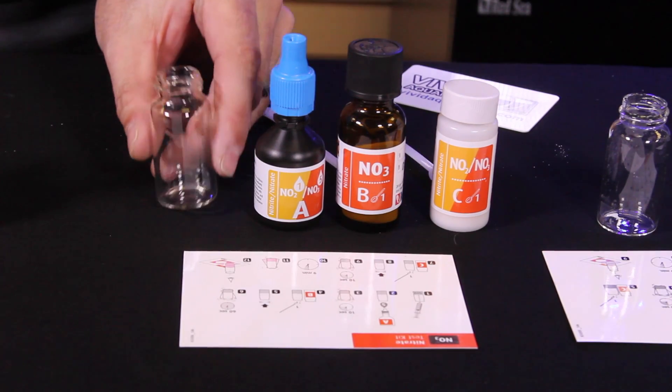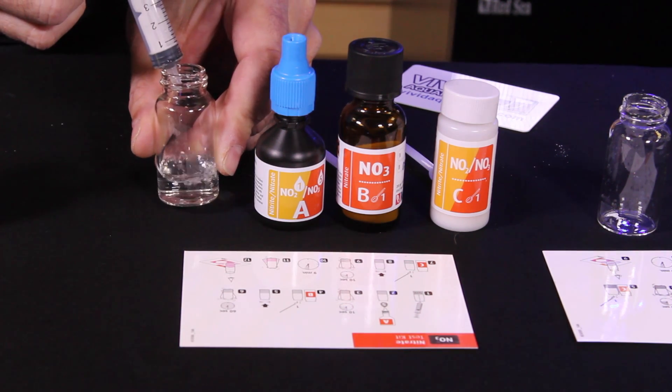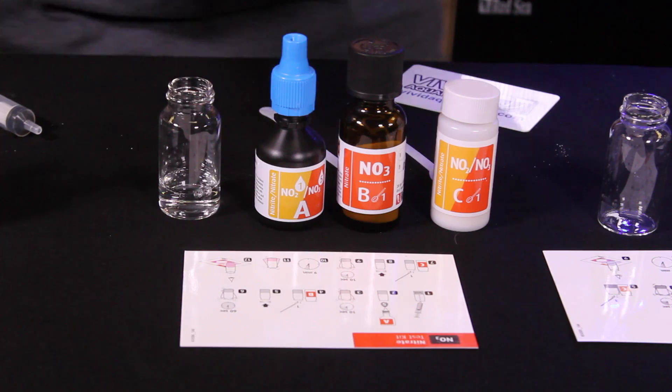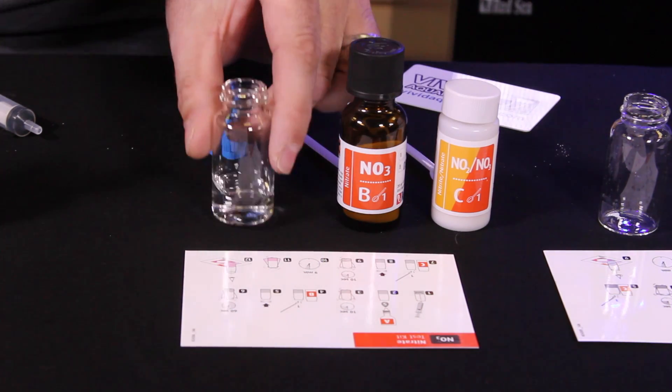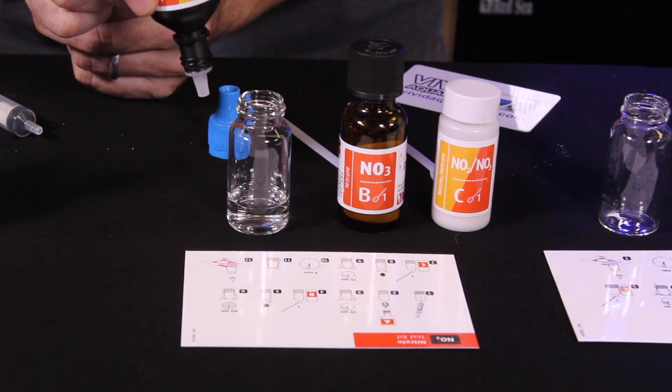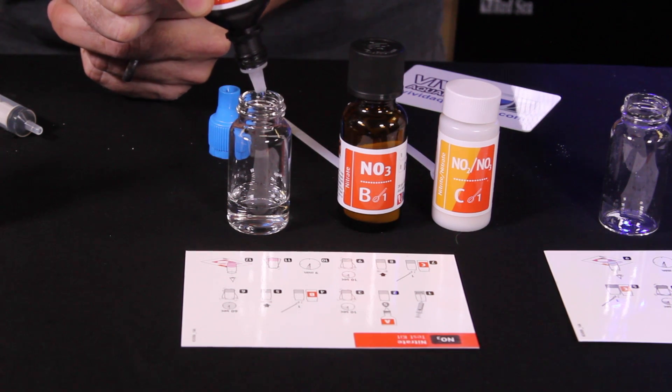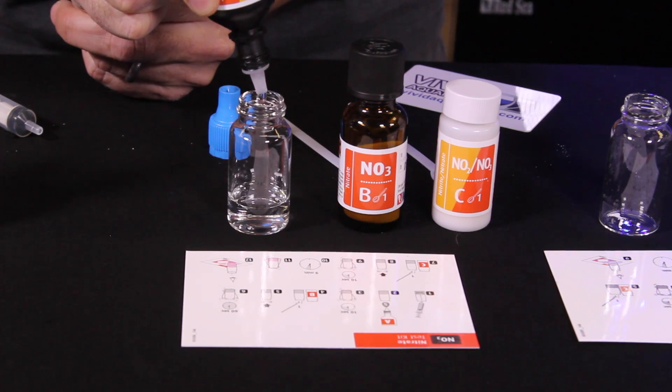Now we're going to go ahead and do our nitrate test. Again, for this test we need five milliliters of sample water into our test vial. The first step is to add five drops of reagent A. Again, we're going to turn that upside down next to the bottle. Make sure we don't get in any partial drops and do five even drops. One, two, three, four, five.